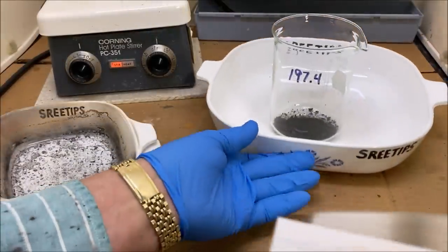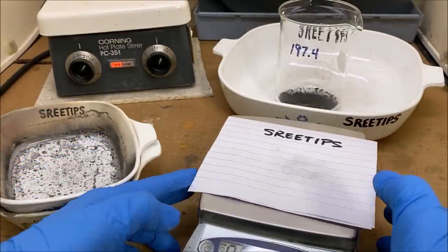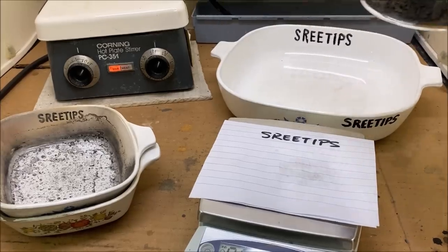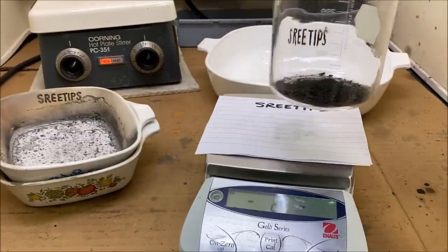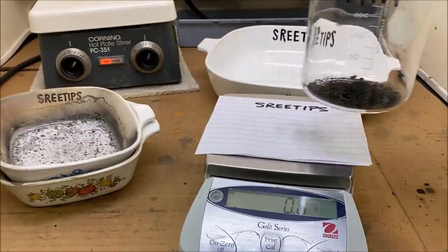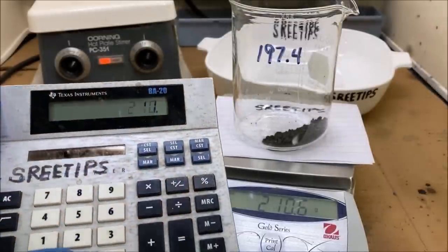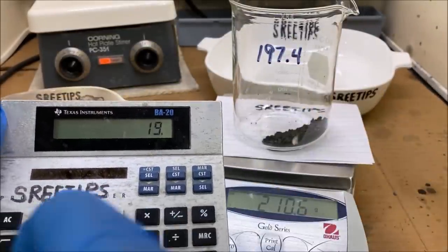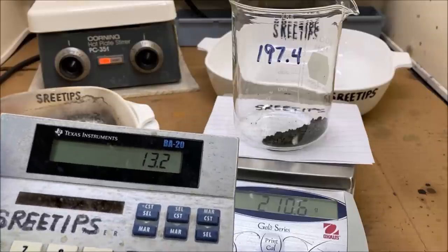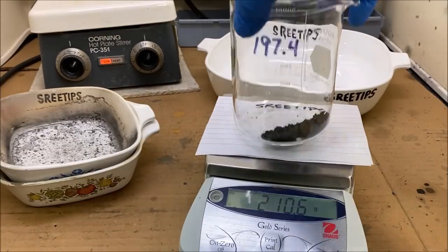Now, out of curiosity, let's just see how much metal we have in our beaker. Let's see what we got. 210.6 minus 197.4. So we've got 13.2 grams of metal in here.